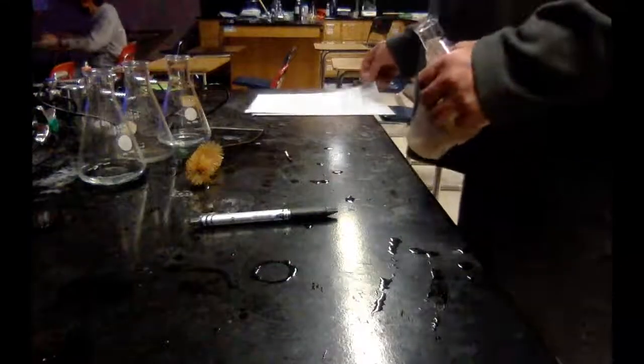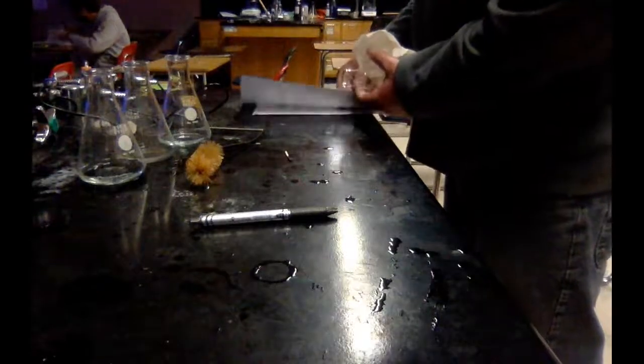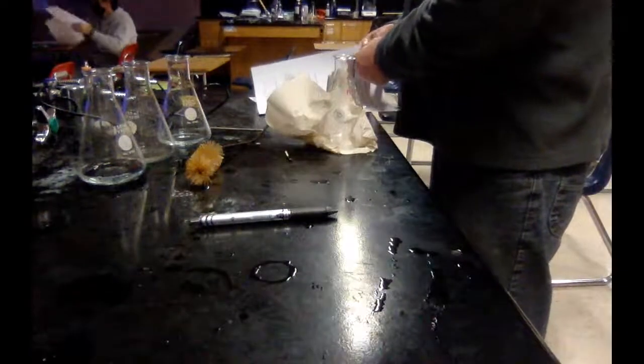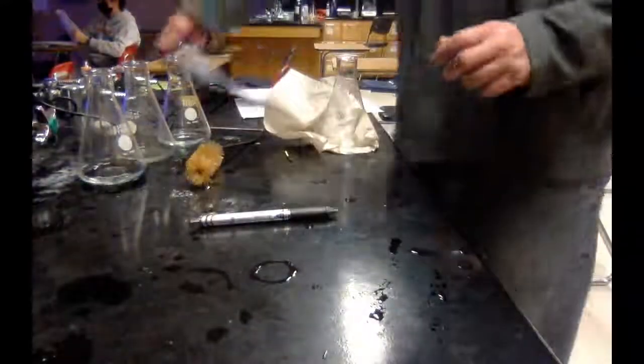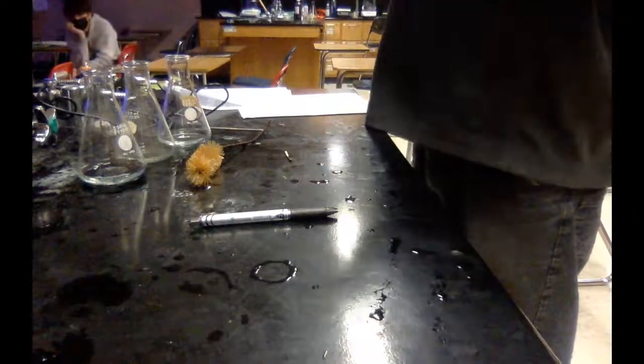So let's calculate out how much of the acid we need. We're going to need 10 milliliters how many times? 4 times, so that's a total of 40 milliliters. So we can use which of our beakers for that? The 50 milliliter, and then just go almost to the top, right? So that's one thing. How much thiosulfate are we going to need?